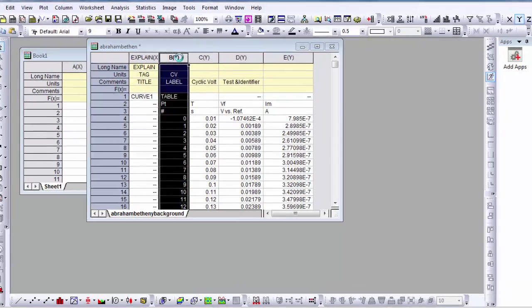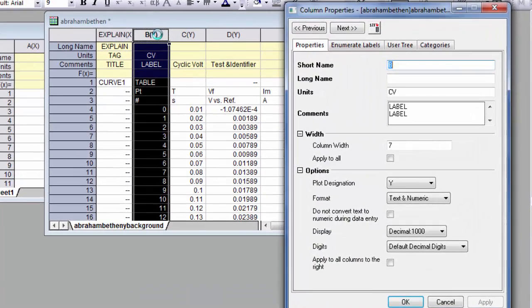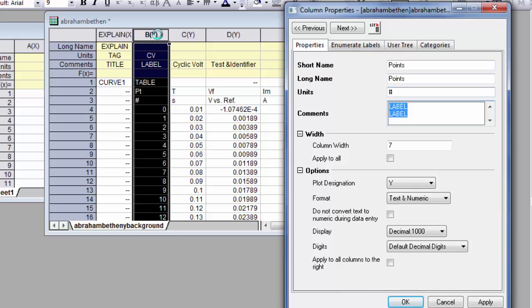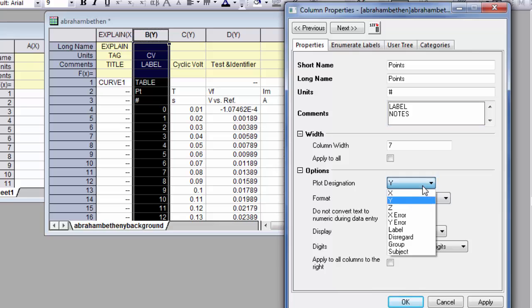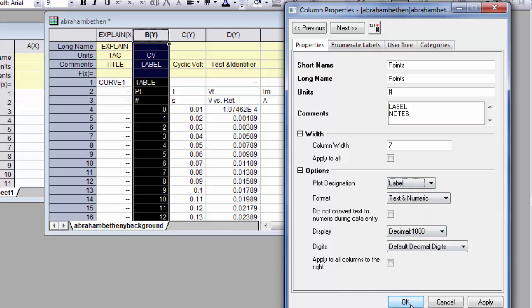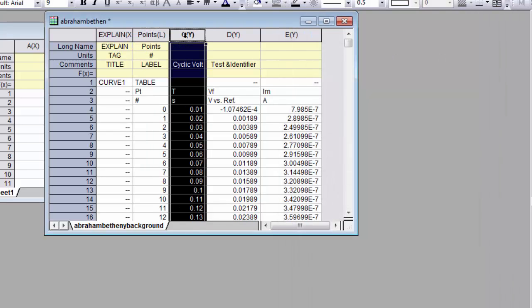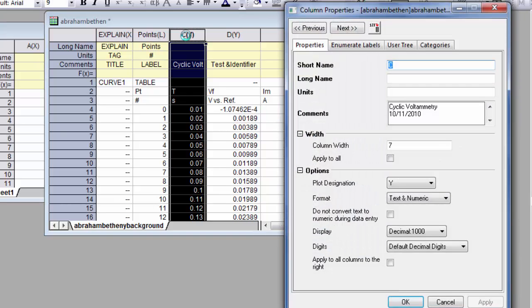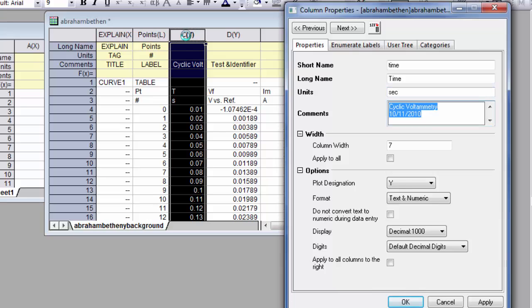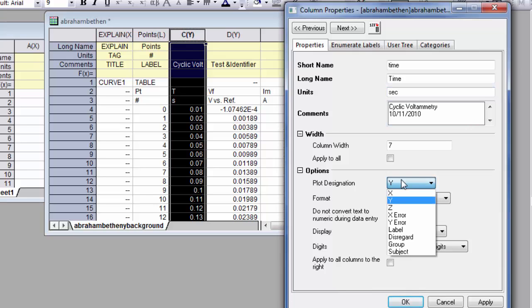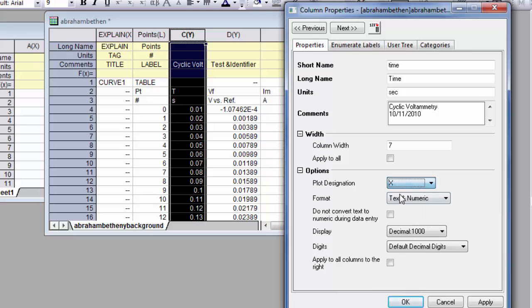So this is the points - just the number of the data point that was collected to help label the data. And this is just a label. This is the time. We're double clicking on the column to edit all this stuff. And the unit is seconds. I guess we could have it as an X, but we're not really that interested in it that way though.